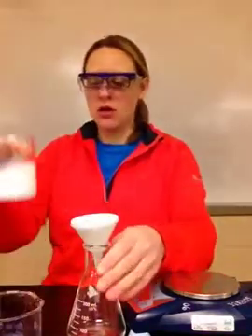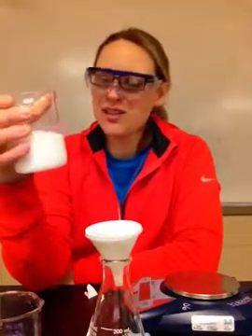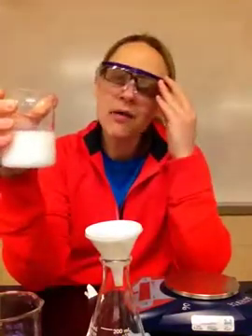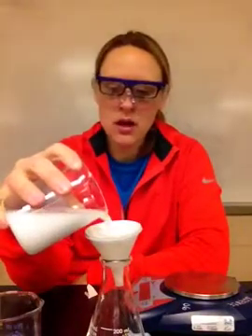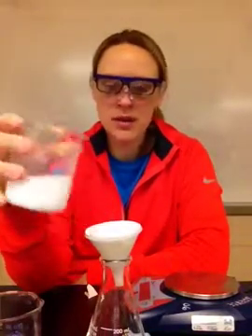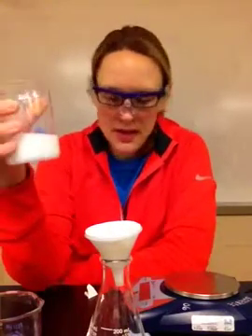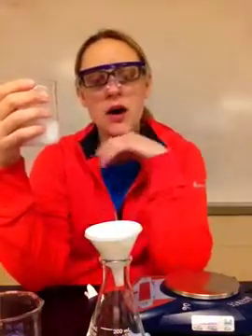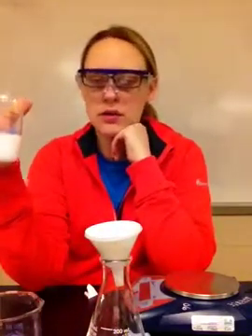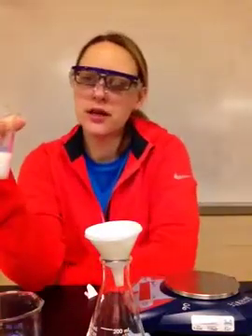Okay, so now I have my solid. It looks more like a milk mixture right now, but it is a solid. Okay, and I'm going to filter this. All right, it's going to take me a little while, because I don't want to overfill it. And that's something that you want to be conscious of, maybe when you're figuring out your water, how much water do I want to use? I want to make sure it gets all dissolved, but it might take me longer to filter it.